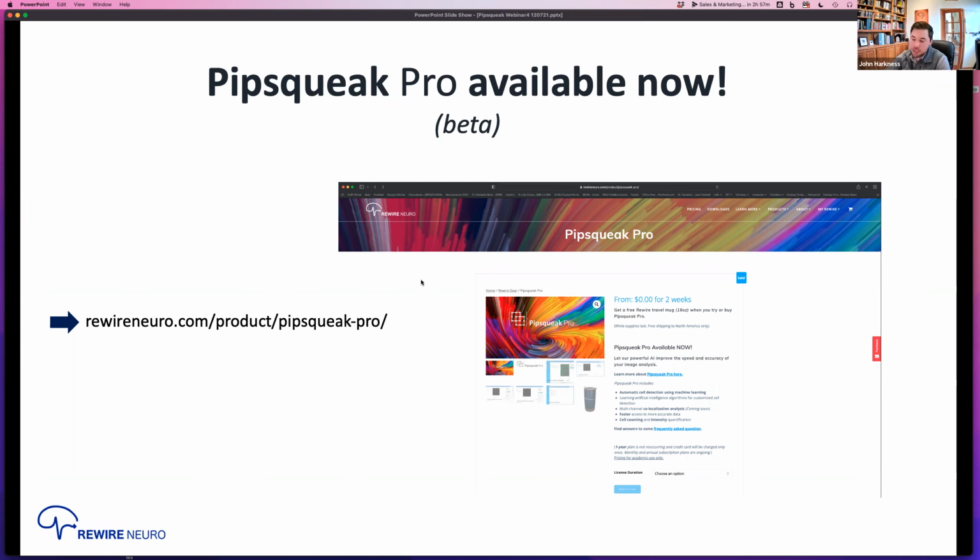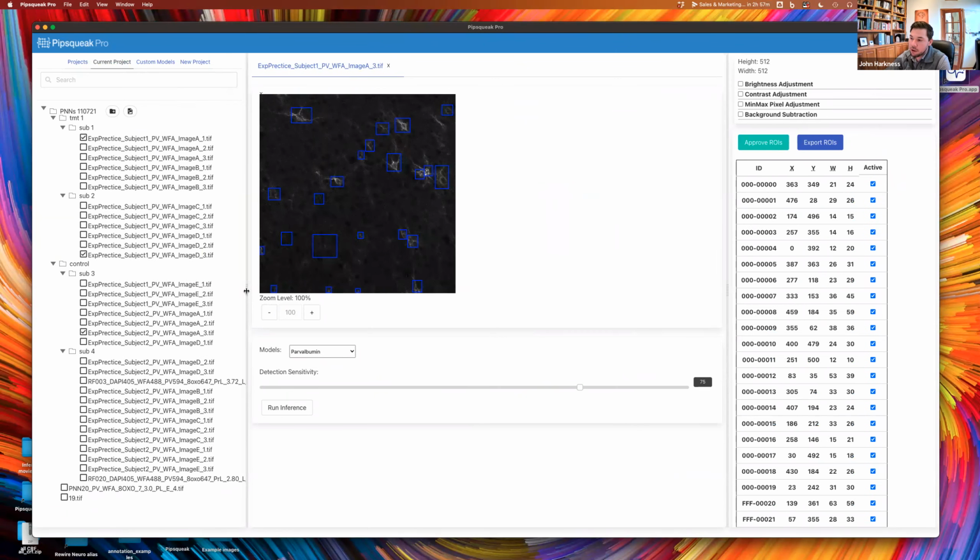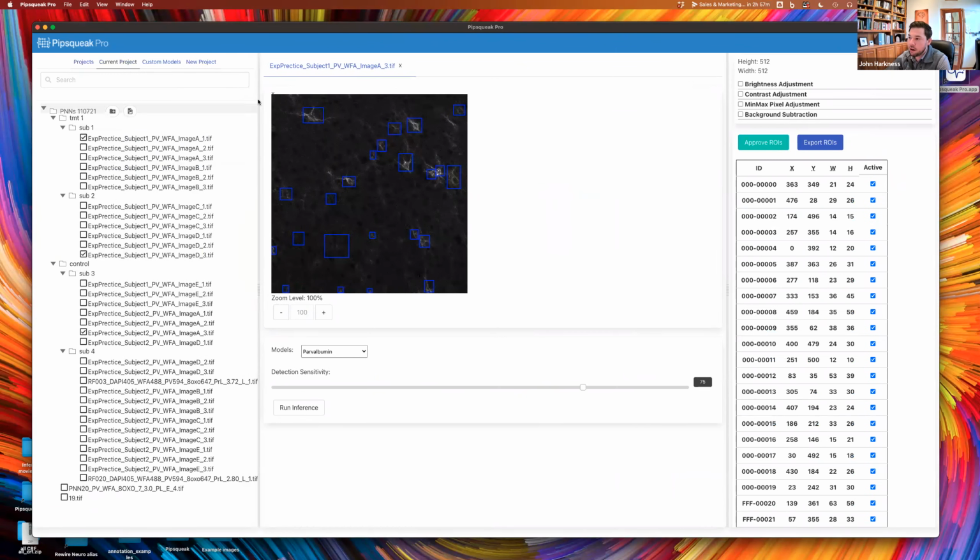Trevor, great question. So the timeline for double label on here is fairly close. We essentially are building out a module that allows these different channels to overlay co-localizations on each other.